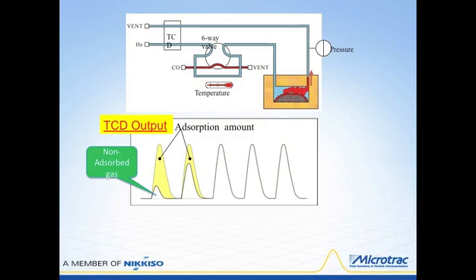So then there's another pulse of the chemical, and again, this is the amount that could be adsorbed completely, but this is the amount that is not adsorbed. So this yellow area again represents how much of the gas has been adsorbed. This continues until we reach a point where these last 3 peaks represent non-adsorbed gases, and the measurement is complete at that point.